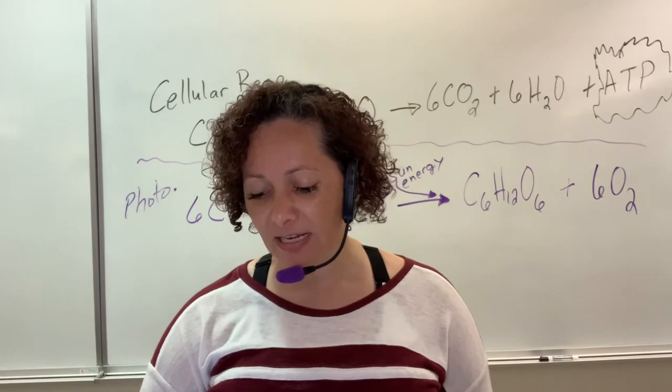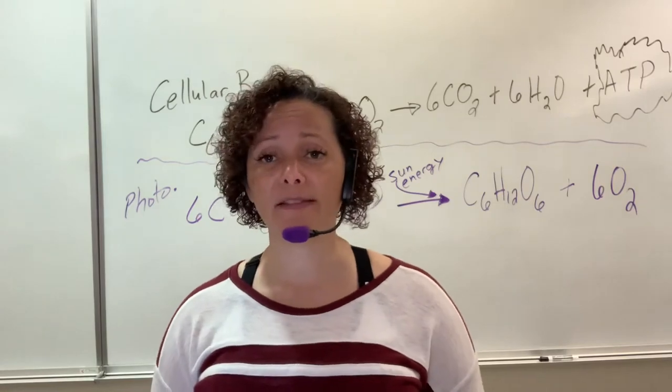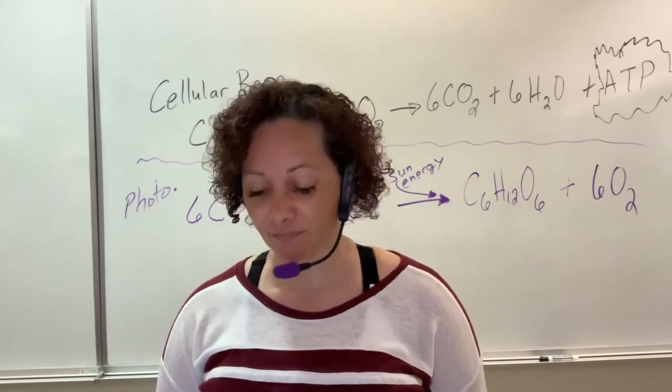I want you to state a hypothesis before you get here for lab. You need to always state a hypothesis before you begin experimentation. Otherwise, it's backward science, and it's not valid.